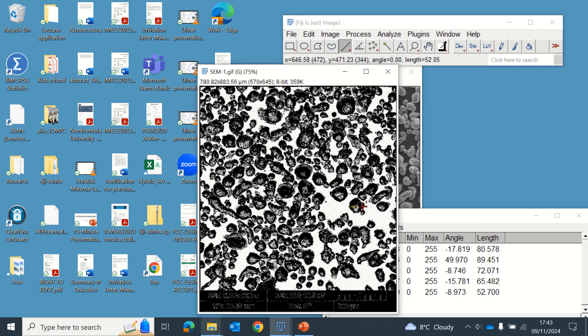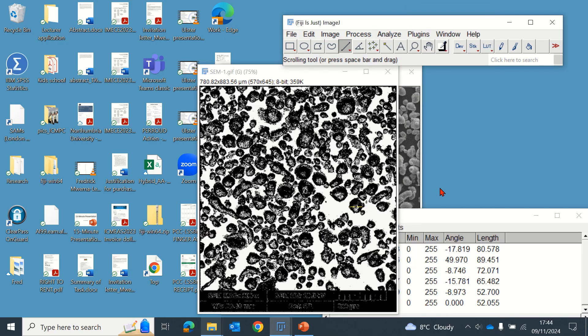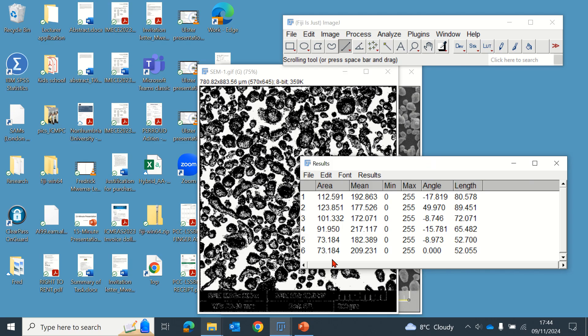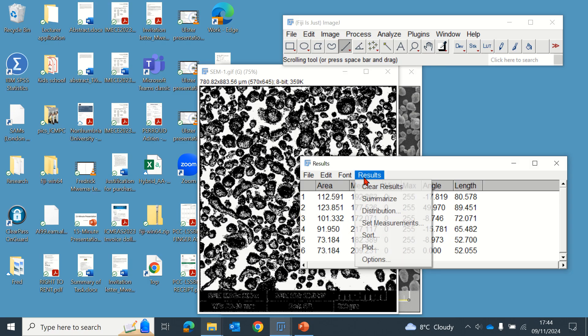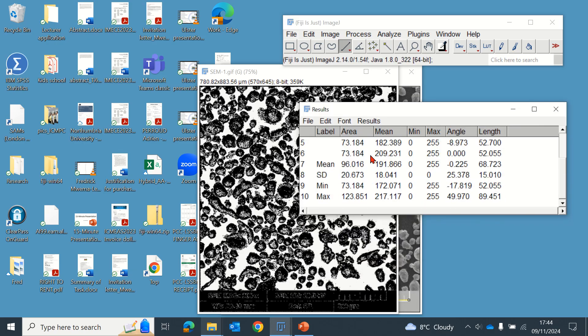So I've done six. You can see the area of these particles. Okay, three of these particles. If you look at the results, you can click summarize. You could see more details on the mean area, standard deviation, and so forth.